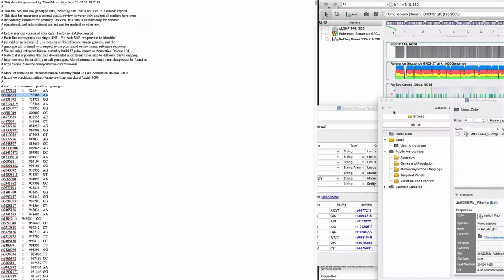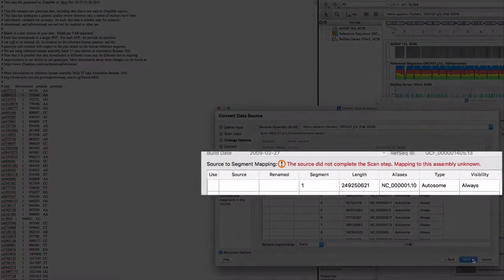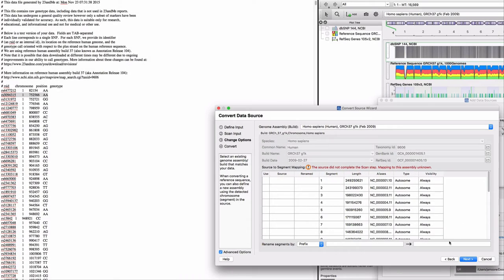You may want to check more, but let's assume there's perfect fidelity in the conversion. My next screen shows a warning in the source to segment mapping. I'm going to ignore this warning and click next.